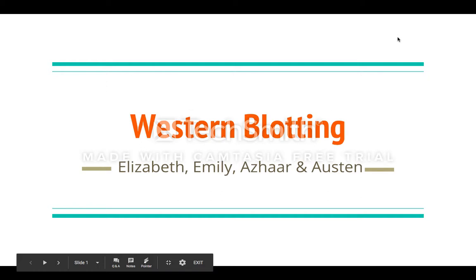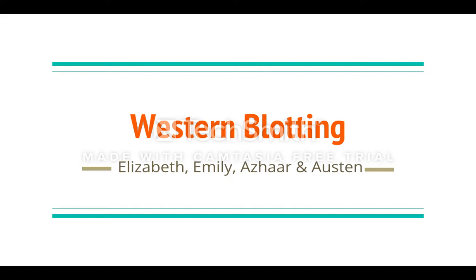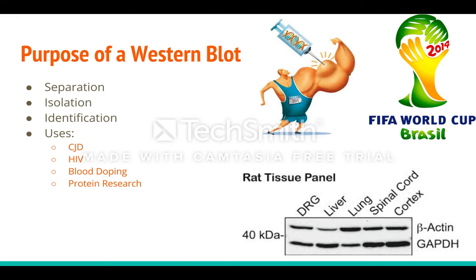All right, so today we're going to be talking about Western blotting. So, what is it, how it's conducted, and a little bit about how to interpret it. So, let's talk a little bit about what we can use a Western blot for.